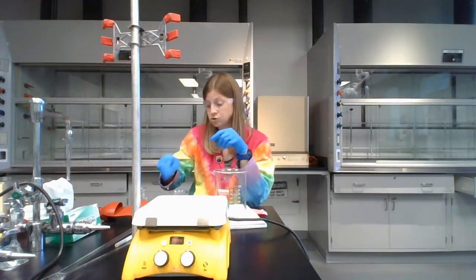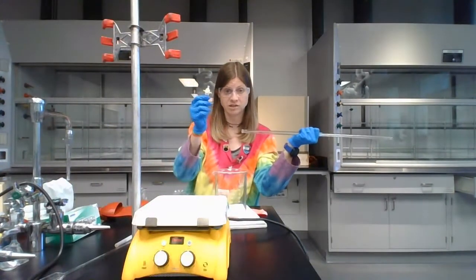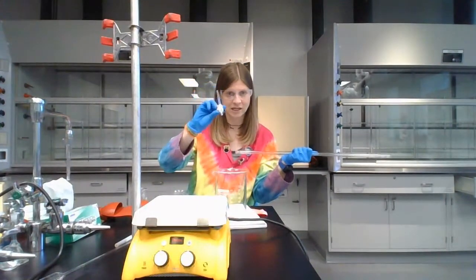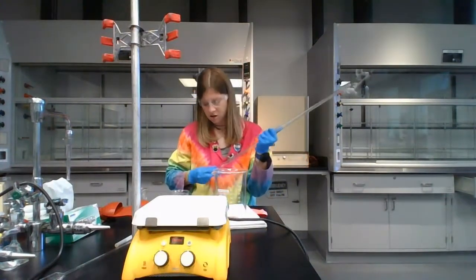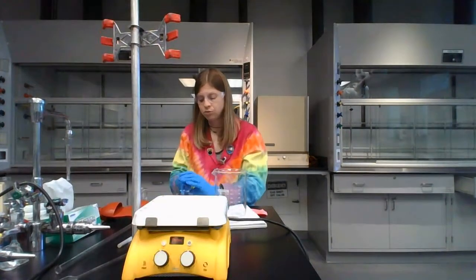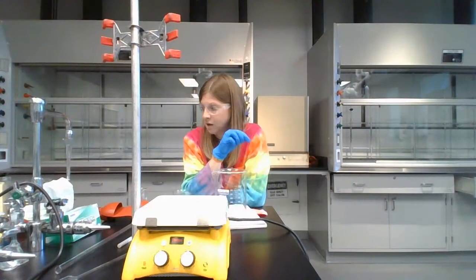You will need to, when you return your burette to the designated container, forgot to mention, you will be removing the stopcock and the tip and dropping it into a beaker that's labeled, filled with oxalic acid, because this is really hard to clean out. It's very narrow. So we're going to let that soak. And then all the rest of your glassware you can just wash and put away, except for the stir bar, which you will wash and then return to the stir bar container to check it back in after you checked it out at the beginning of lab.